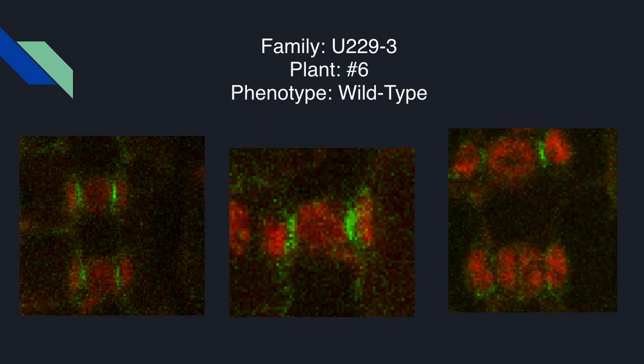Okay. Now, analyzing the confocal images of our plants, you see plant 6 is obviously a wild type phenotype. One thing about this plant is that it's very advanced, which may explain the larger numbers we got when compiling this data. The actin patches are very large. You can see them pretty clearly, and you can even see the stoma as it's already splitting up.